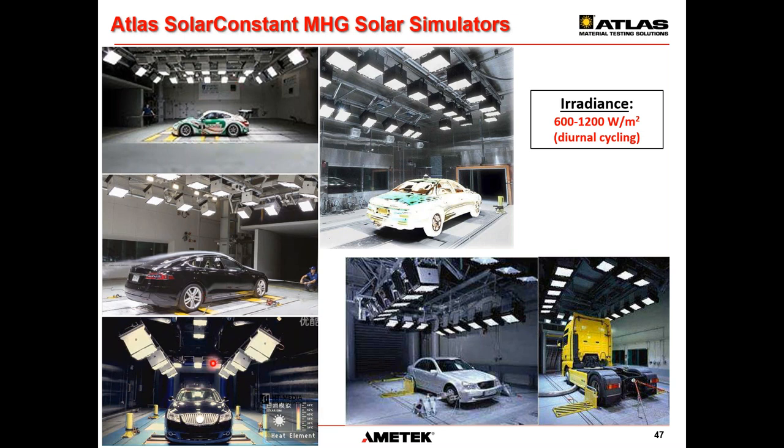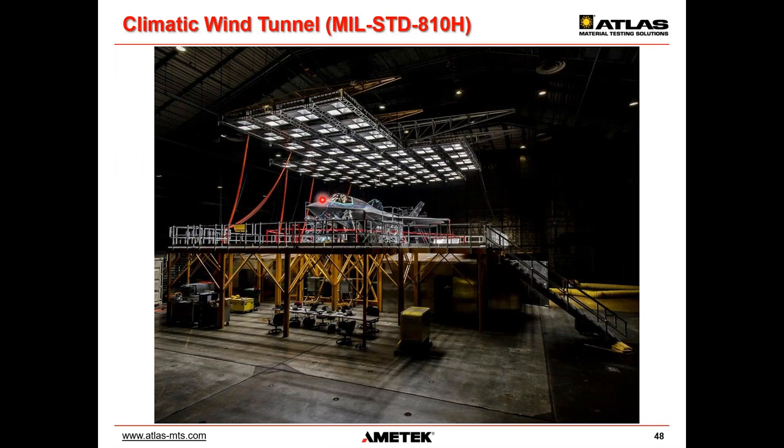That's a very typical application, all outside of weathering. This is not weathering testing. This is really performance testing and also testing extreme, realistic temperatures and the effects on the majority of the electronics inside a car. Also effects on planes. This is then really the solar effect on the avionics. Is everything fully functional when they get really extreme thermal load from the sun? So we are not checking the durability of the coating here. We're really checking the functionality of this jet, which can really be driven inside this test chamber completely under full load, and they can simulate all the flights and conditions they need.